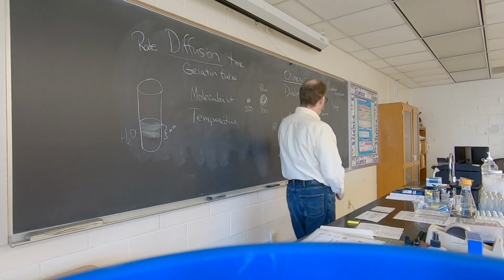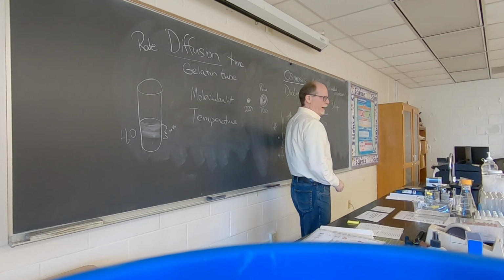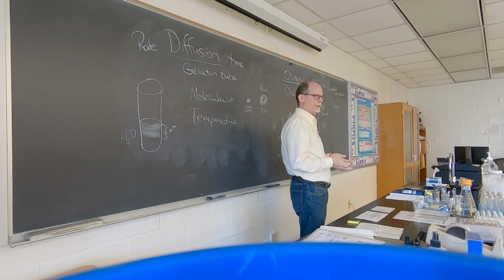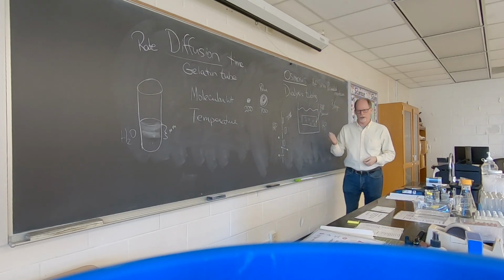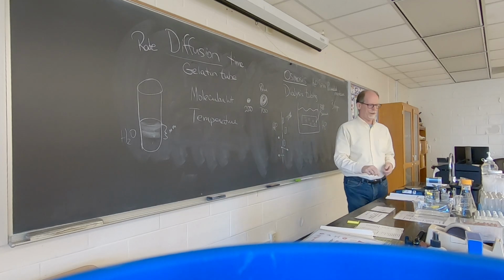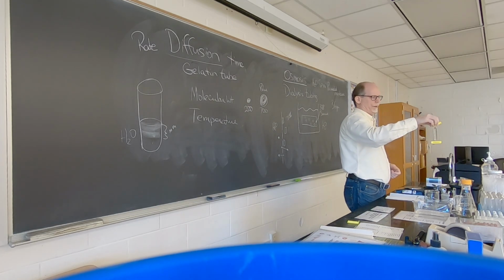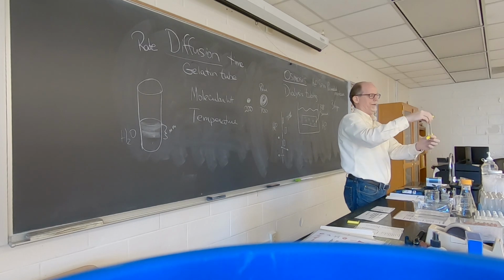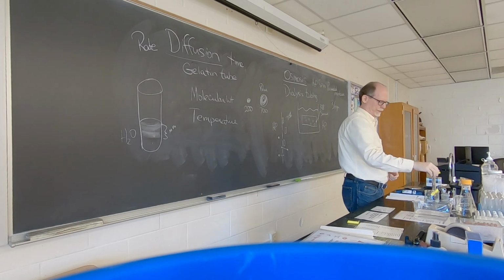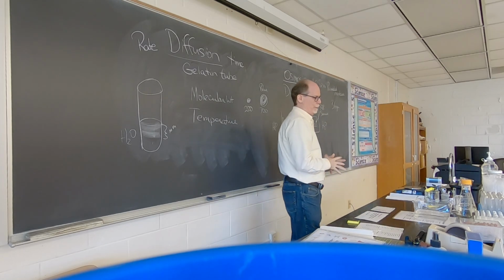So that's one explanation. We'd expect in an hour that this bag would weigh more because more water is going to tend to want to go into it. Now the problem with this experiment was when you pull out this bag, it drips with water. So a lot of this water that's attached wasn't attached before we put it in there. Kind of screws things up a little sometimes. So you have to be careful to get rid of most of the water.